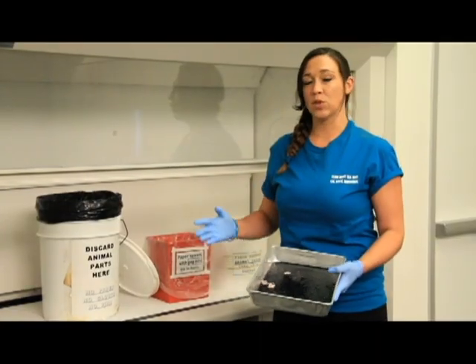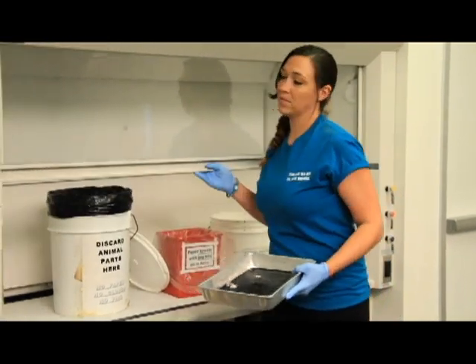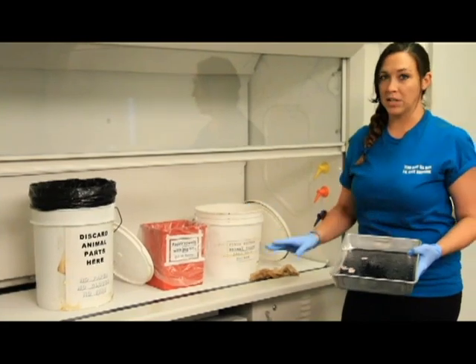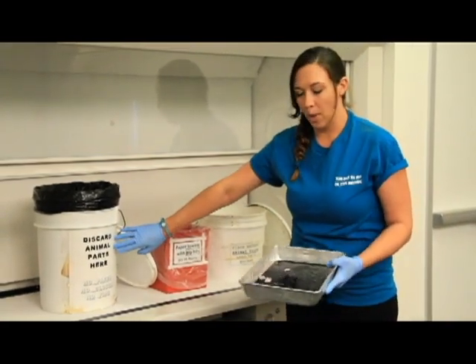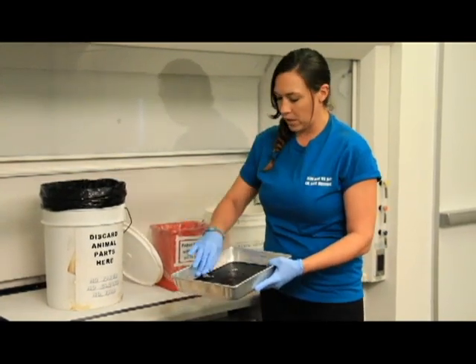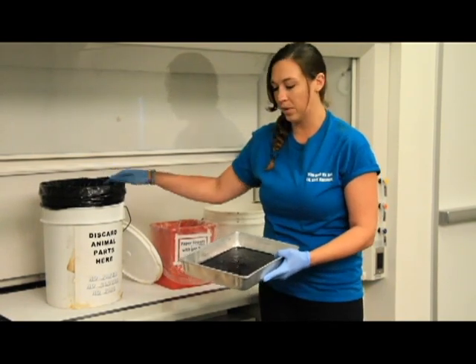The next step takes us over to the fume hood. Now if the fume hood is down, all you have to do is lift this up, it slides up, and then there are 3 buckets, and each of these buckets has a very specific function. This first bucket is just for animal parts. Anything large that we can pick up with our hand, you want to throw in there. So we want to get all these large pieces out, anything that we can pick up with our own hands.